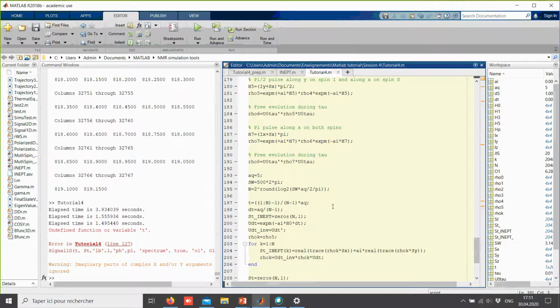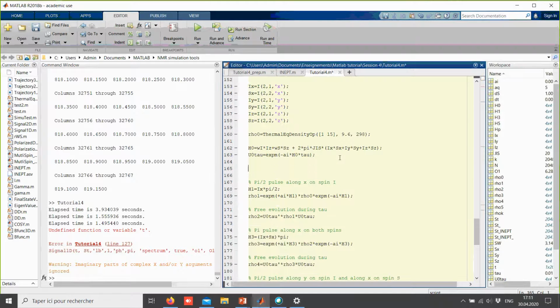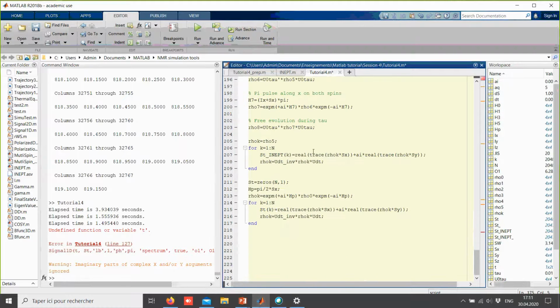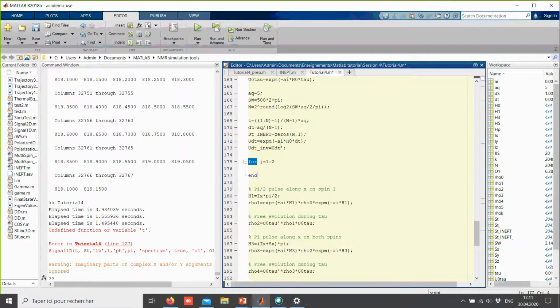So I'm going to make a loop where I put my two signals in a different vector. So this will all go in a loop. I'm going to move this outside of where the loop will be. This goes in the beginning before we start the loop. And here will be the loop. Here I have used index K, so now I'm going to use J. And there are two steps in the phase cycling, 1 and 2.